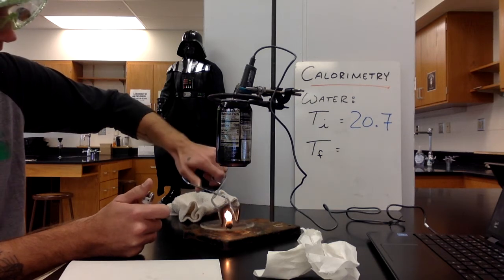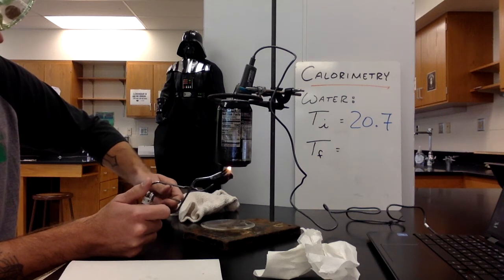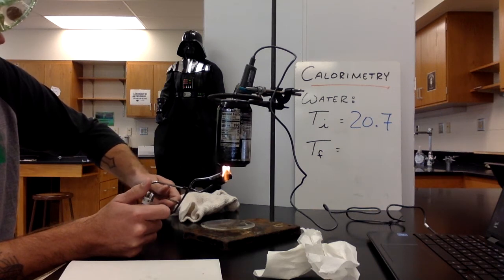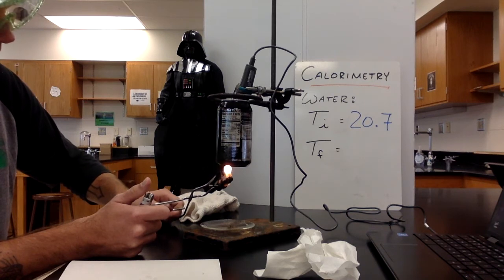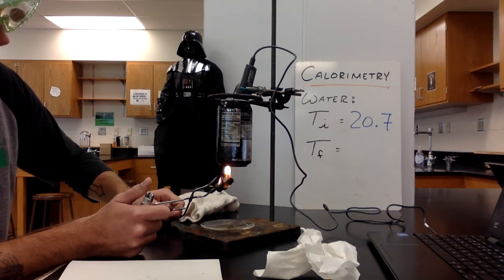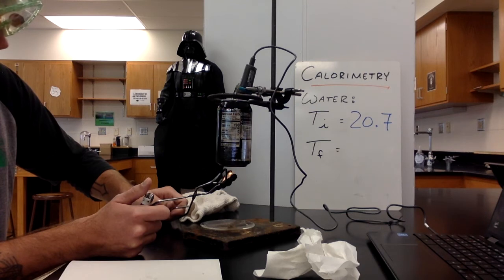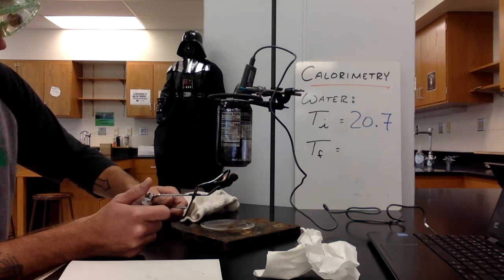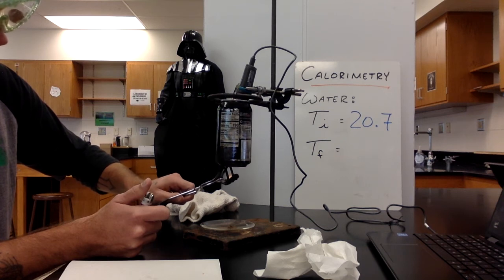You're not done burning yet. Extra crunchy. It doesn't want to stay up. There you go. Good cheese curl. Little flame still. This one's hanging on.